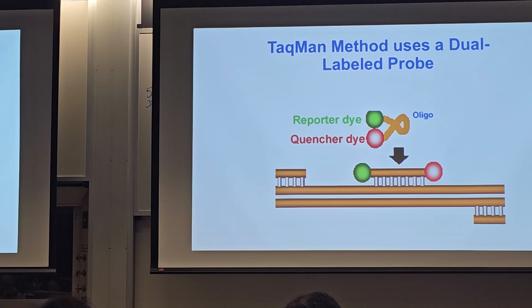Now, what I'm here to tell you is that if your primers are really specific and you only get one product, then the two methods give you the same result. And we're going to have one of the labs do SYBR today and one of the labs do the TaqMan system. The PCRs are set up exactly the same. So there's no difference really in your protocols, except for a very minor change, and that's that this one includes a probe and the other one doesn't.